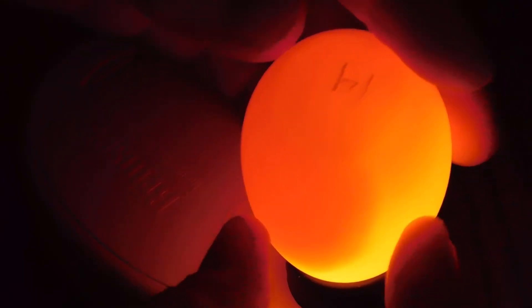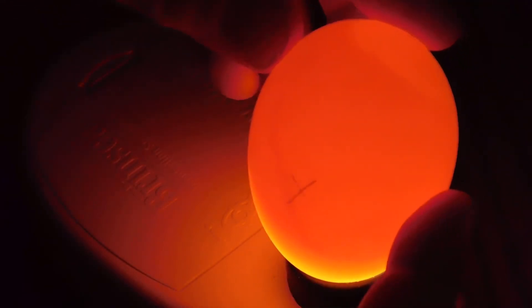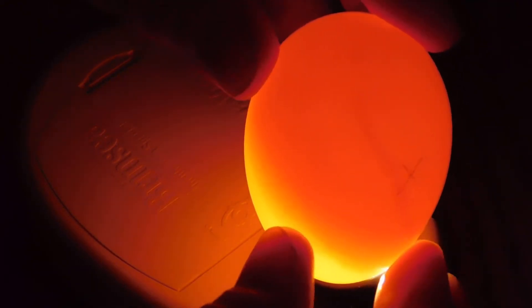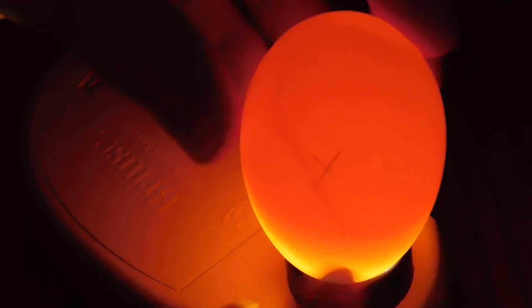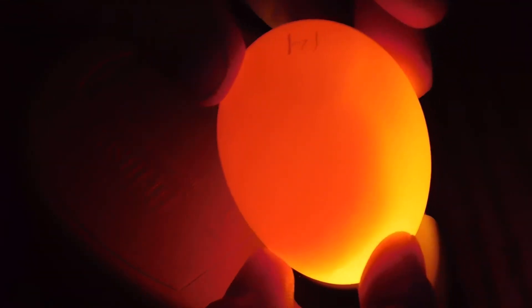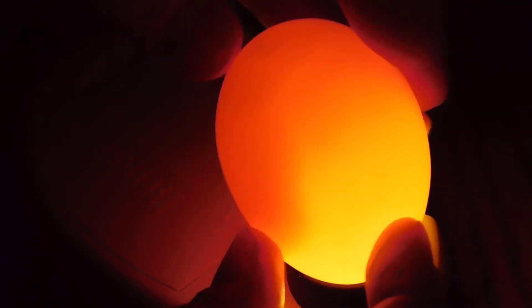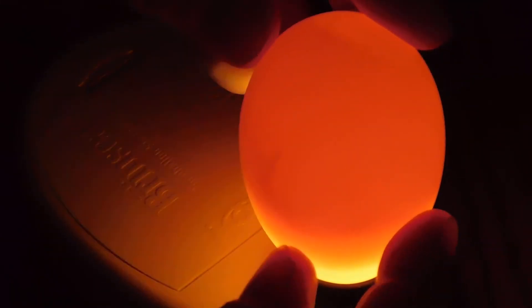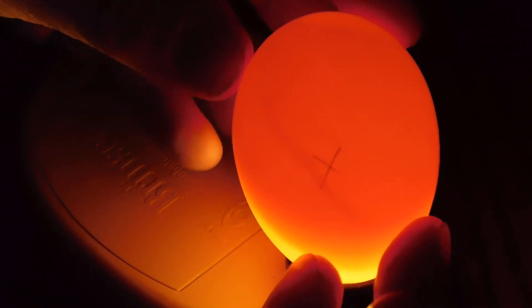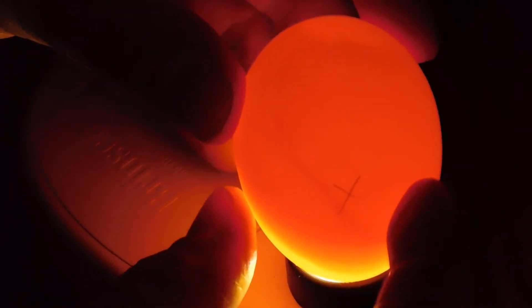Number fourteen - this is the last one from my hens in this first incubator. So this one looked like it had a vein start, looked like it started, but I'm not seeing an embryo in there. Chances are this one might have started developing but for some reason may have stopped. But we'll keep an eye on it and check it next week. Won't count them out yet.